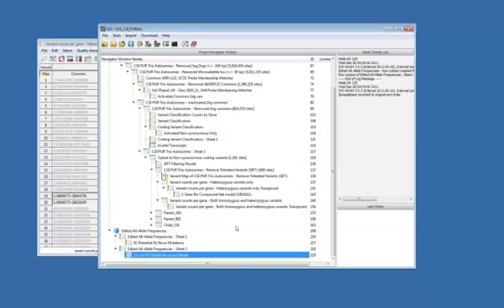So that gives you kind of a brief overview of some of the tools that are available for filtering and annotating genomic variants and for interactive exploration of the data.